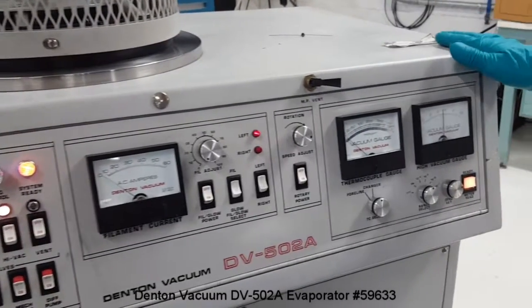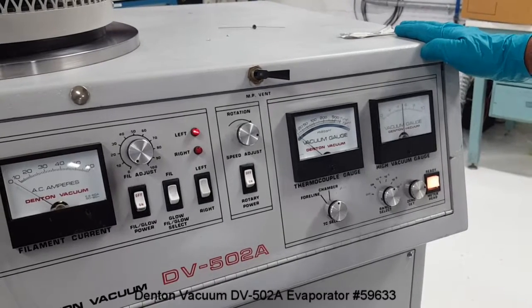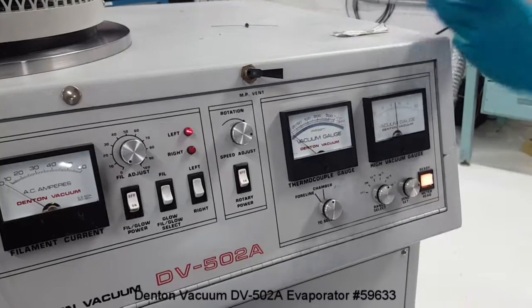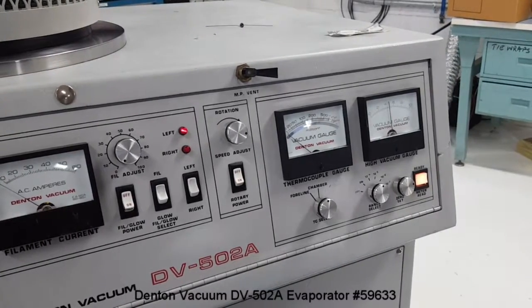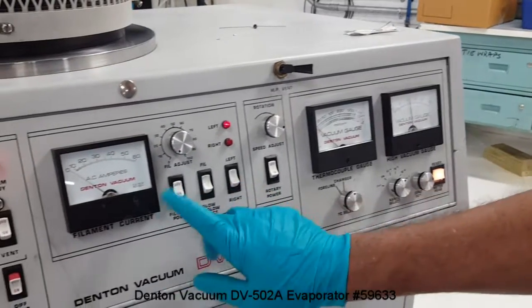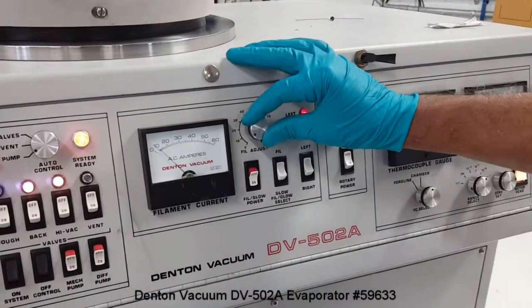Every time the chamber is opened and pumped down to reach the 10 to the minus 6 range, it will take about 10 to 15 minutes. I'm going to start the evaporation process just for demonstration.